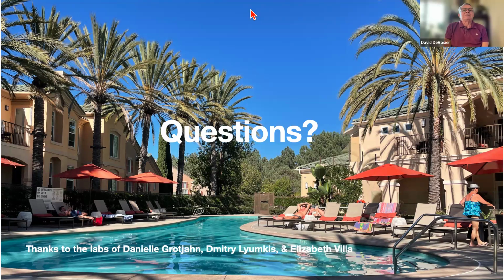And then from Eva Nogales: hi Eva, when do you think 2D versus 3D template matching would work better or worse? 3D template matching seems to do better, according to that one paper. But they used different ways of doing the matching, so it's not clear to me what part of the increase from 300 to 100 kilodaltons might be due to the algorithms they use and what is due to doing it in 3D.